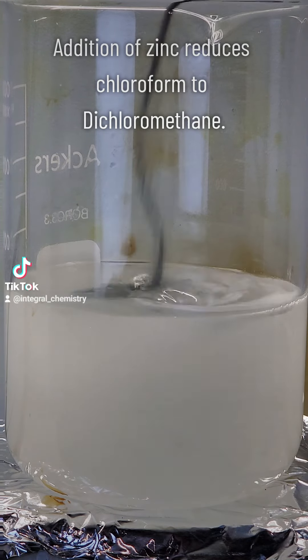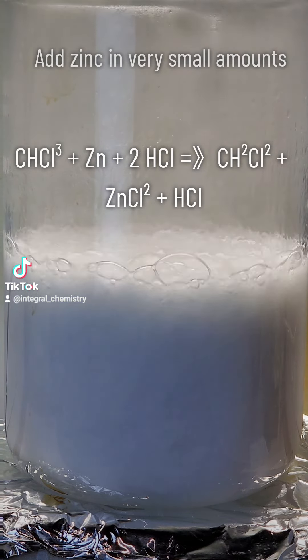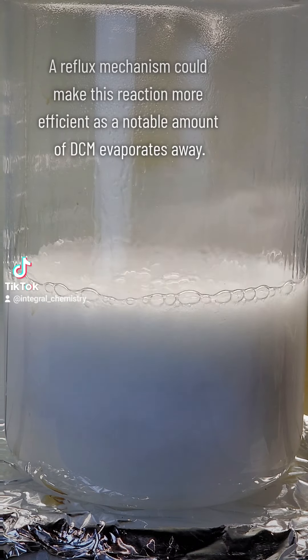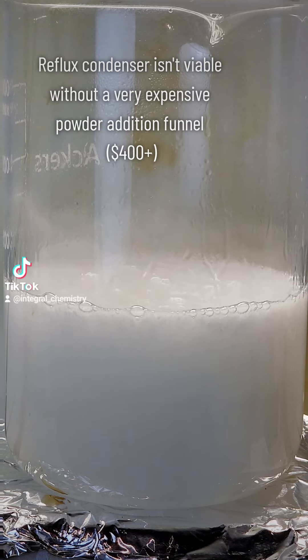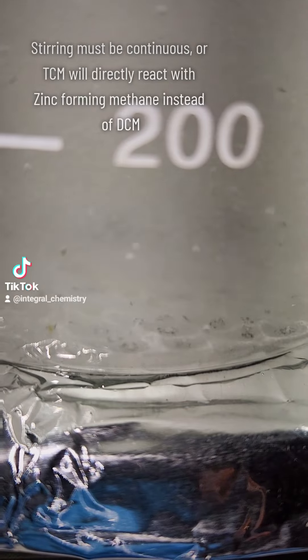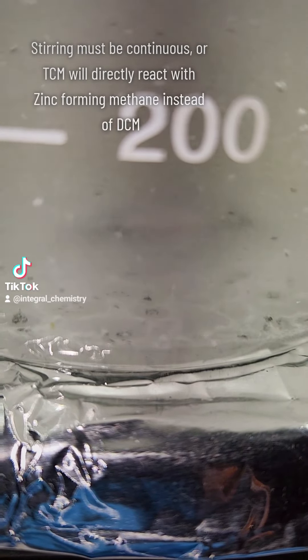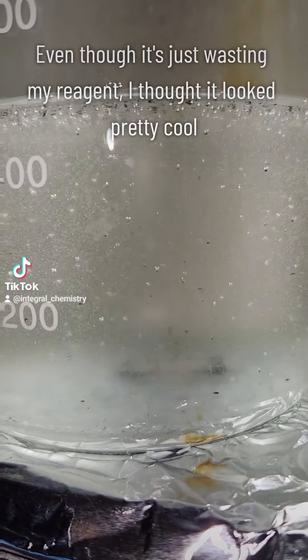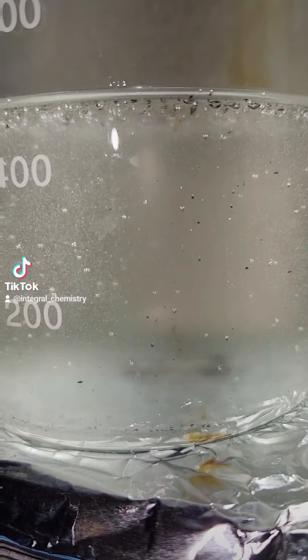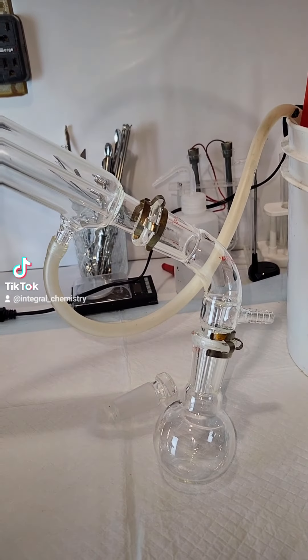I think the two major sources of inefficiency in this process both come from the fact that zinc has to be added last, as seen here. Because zinc has to be added last, some amount of the zinc is invariably going to react with the hydrochloric acid before it can reduce the chloroform. And because most people don't own a powder addition funnel, a lot of the DCM is just going to evaporate away and be lost. The methane bubbles you can see on screen right now are the product of chloroform reduction without hydrochloric acid, and this is all you'd get if you added the hydrochloric acid last.